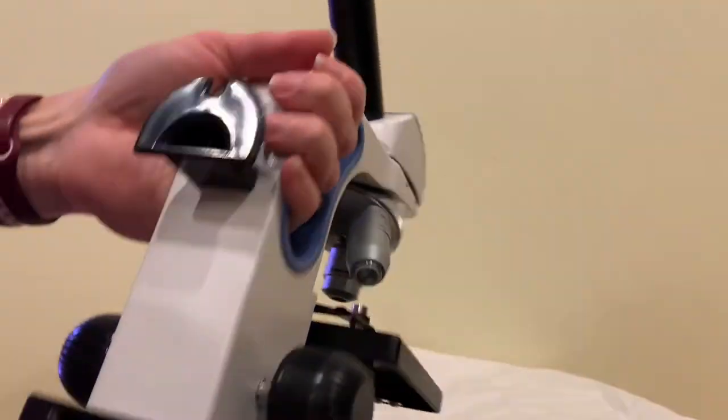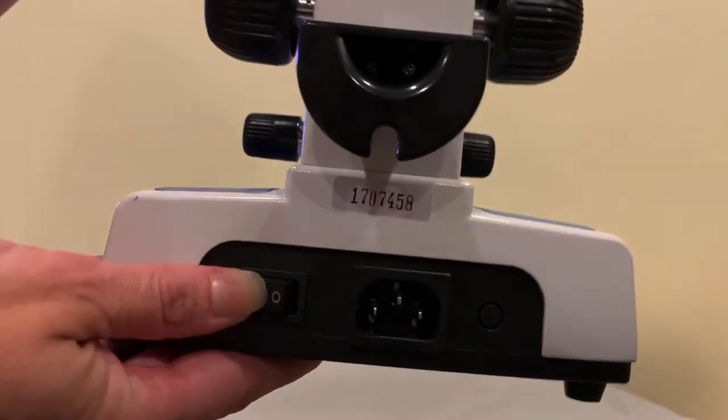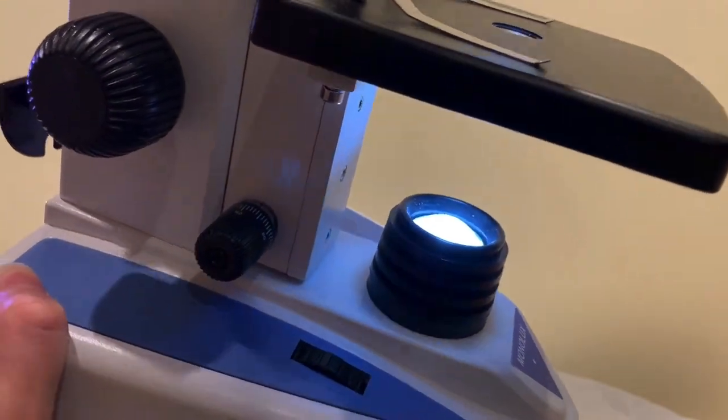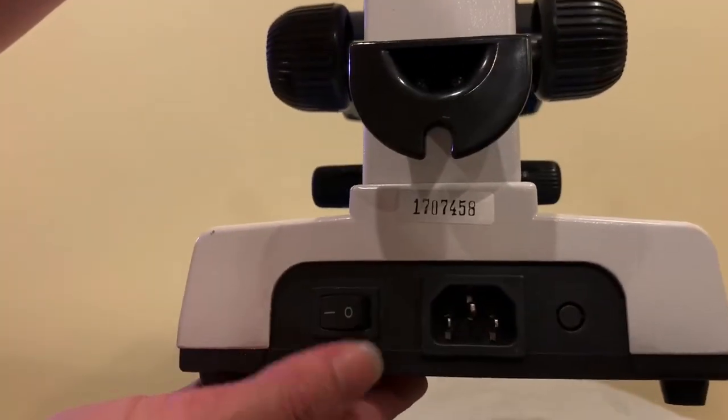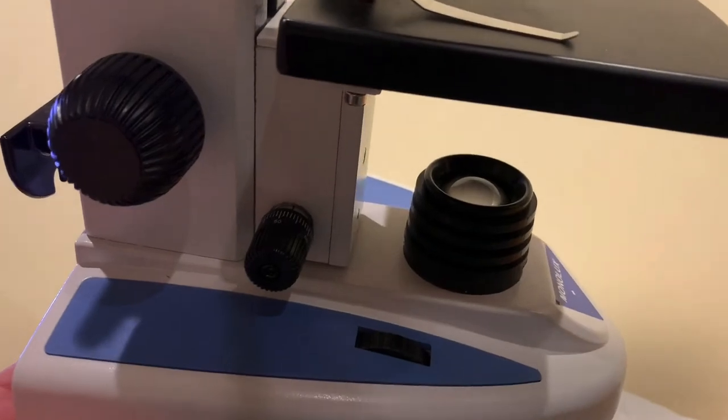Next we have the on and off switch. Turn the microscope on. You turn the microscope on, this light turns on here. And when we turn the microscope off the light turns off. Fancy that.